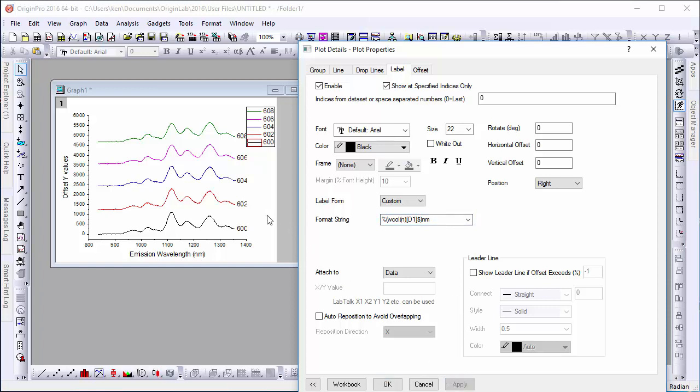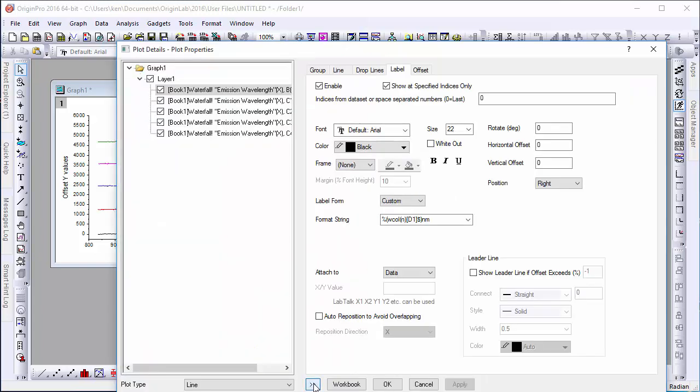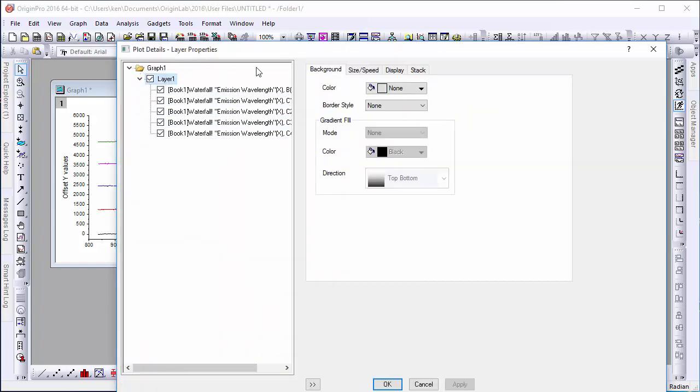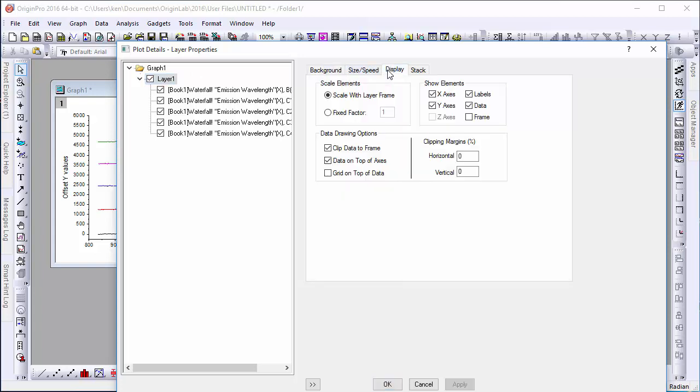The label may go past the boundaries of the graph. However, to rectify this error, we'll need to select the graph layer, open the Display tab, and uncheck Clip Data to Frame.